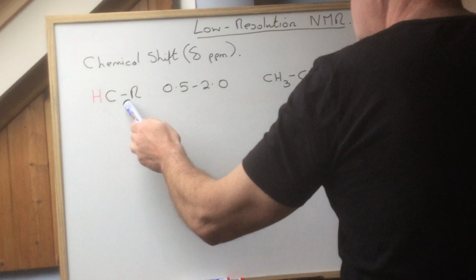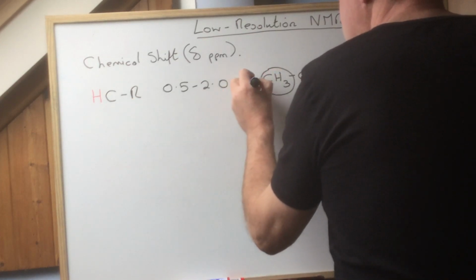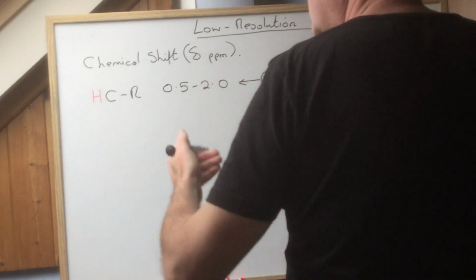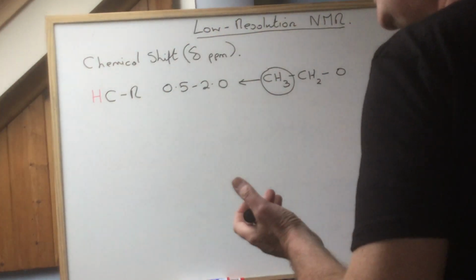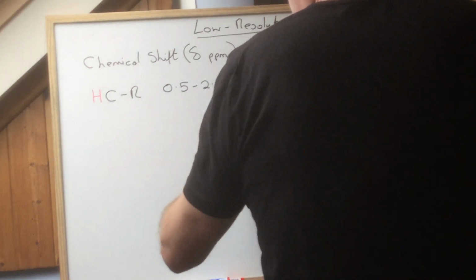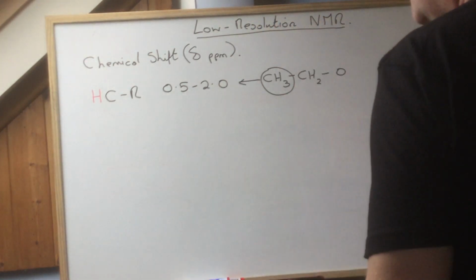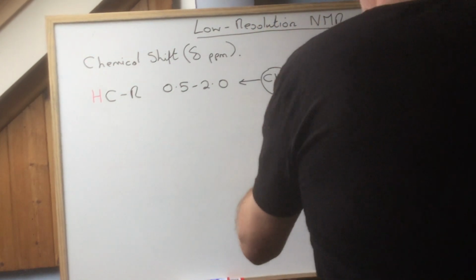This is misleading, I suppose, but those protons there will have that chemical shift. In other words, the protons that are in an ordinary hydrocarbon chain have chemical shifts within this area, so there's a lot of them, and they're very prone to splitting, which we'll deal with later.